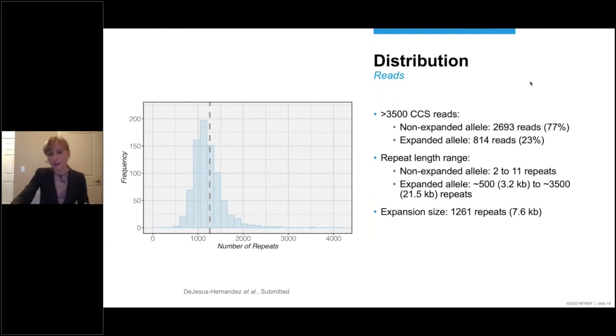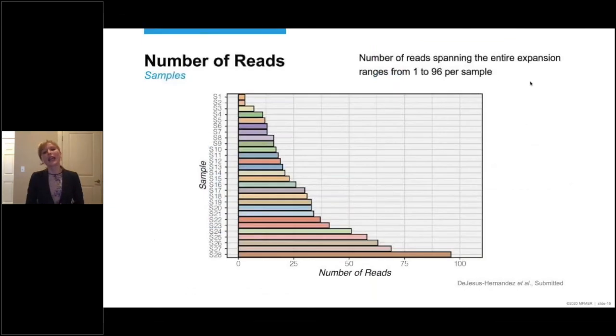And this is an example of a bar graph showing every individual sample 1 to 28 on the x-axis. And every bar represents the number of reads. And clearly, you can see that there is a lot of variability. For some individuals, we only captured 1 read. And for others, almost 100. In the next few slides, I will provide a couple of explanations that might at least account for some of this variability.